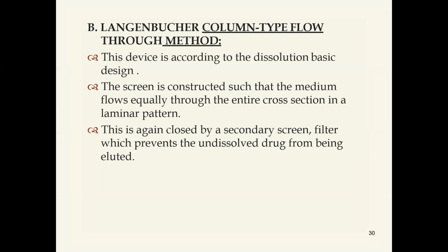And here one more thing is there in the Langenbucher method: a filter. By using this filter, we can prevent the undissolved drug from being eluted. So this is one of the provisions in the Langenbucher method.